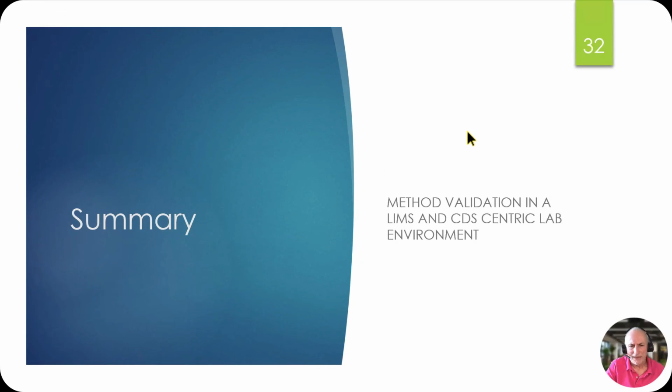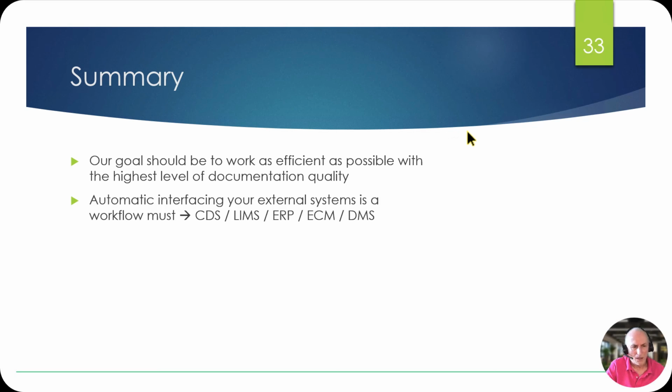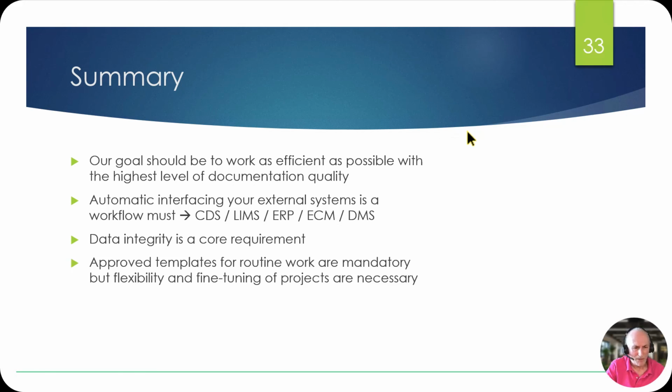Summary. Method validation in the LIMS and CDS-centric lab environment. Our goal should be to work as efficiently as possible with the highest level of documentation quality. Automatic interfacing of your external systems is a workflow must: CDS, LIMS, ERP, ECM, and DMS. Data integrity is a core requirement. Approved templates for routine work are mandatory, but flexibility and fine-tuning of projects are necessary. Tools must be validated and their installation qualified. IQ, OQ, PQ.